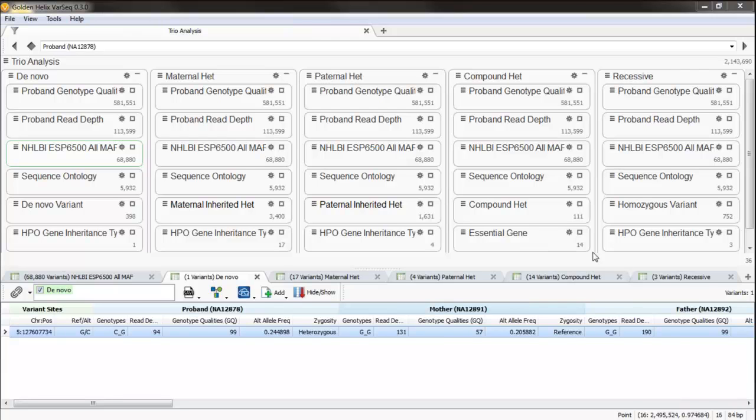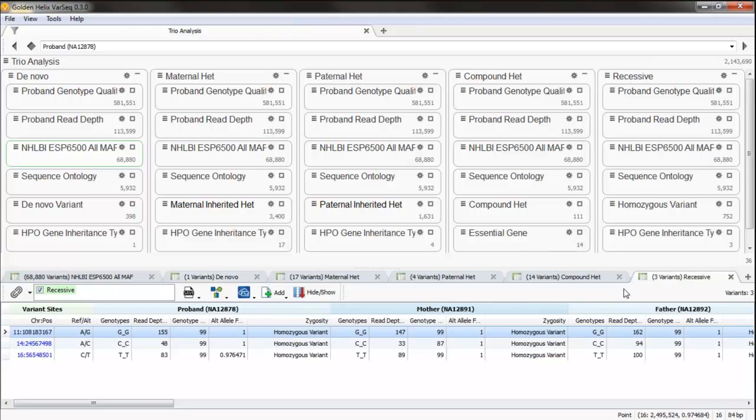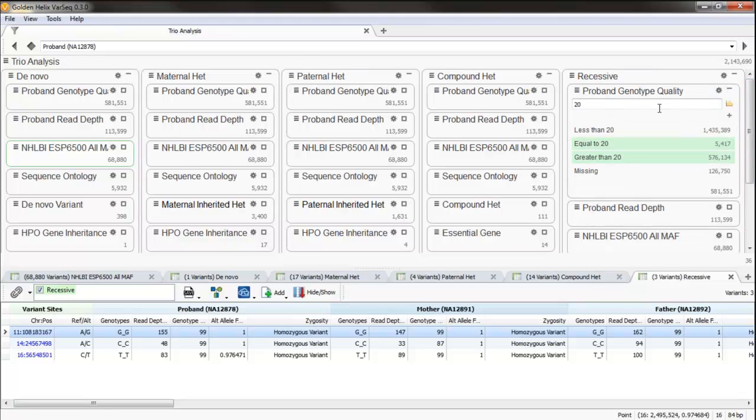So finally, the last thing I wanted to touch on is that last point of, can we really be confident that this process of getting to these three recessive variants isn't leaving something out that I might want to investigate? The thresholds aren't very sensitive, but they're rather robust, right? So obviously, I did a lot of filtering to get to this, and I can inspect all of these steps like I showed before by expanding them out.